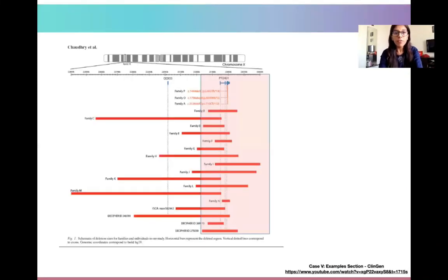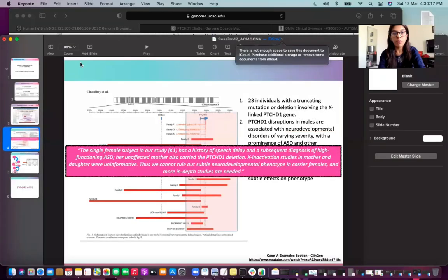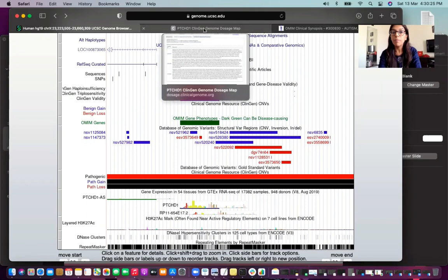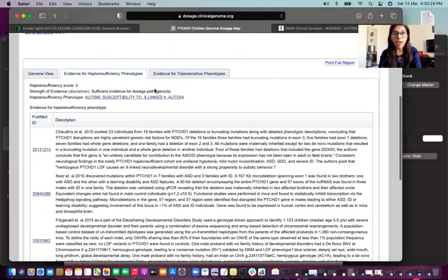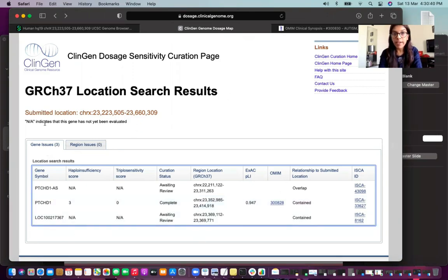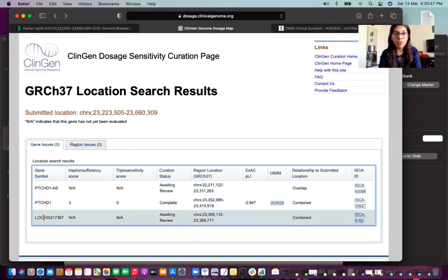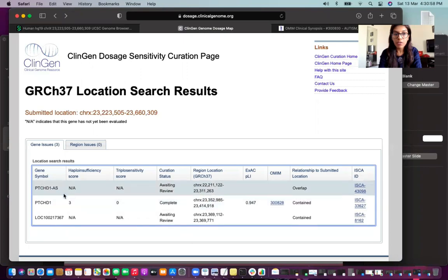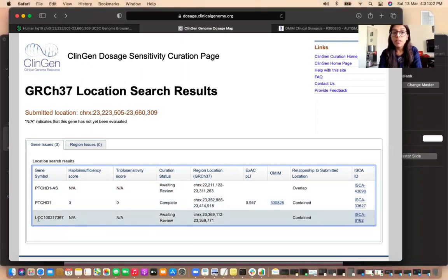Next, we go back to the ClinGen dosage sensitivity curation page and submit our location using the coordinates. We are redirected to a page showing 3 genes present within the region, which is important to evaluate for section 3A. However, only one is a protein coding gene; one is an anti-sense gene and one is a predicted gene, which is why they were not visible in the RefSeq curated track of the UCSC browser.